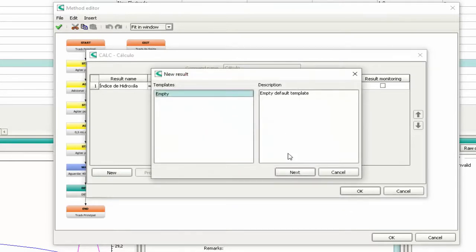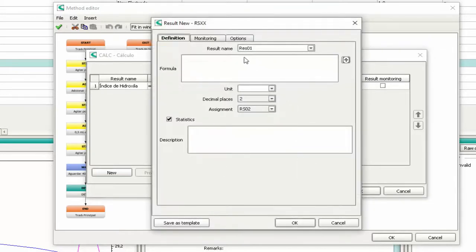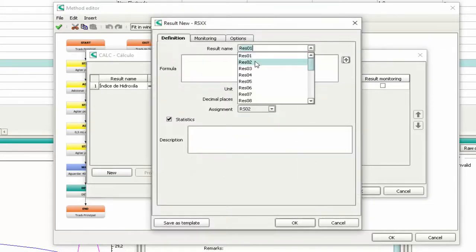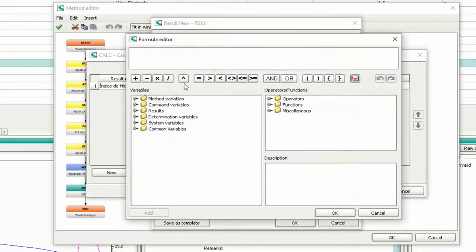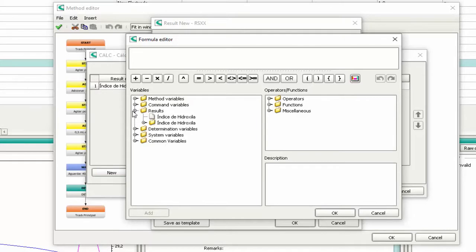Press Next. Give a name to your result. Click on the formula editor button. You can navigate through the left menu and add the components to your formula.